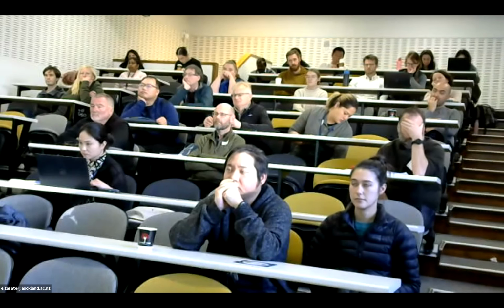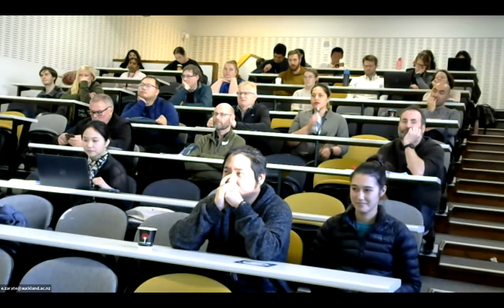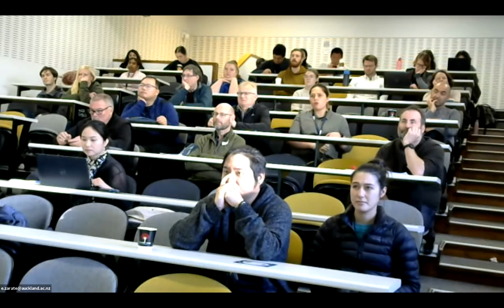So here they've got the masses in some circles, and blue represents unknown compounds, and the other color represents compounds that have matches in their databases. So it's networked some of the compounds that we put in. A lot of these couldn't get references, so they just left them out to themselves. I had to crop this because it went quite a long way. But it's named some of them, and we found literature that says that these are also known metabolites of penicillin, which is good because I didn't tell GNPS what organism we got the sample from, but it identified the compounds anyway.